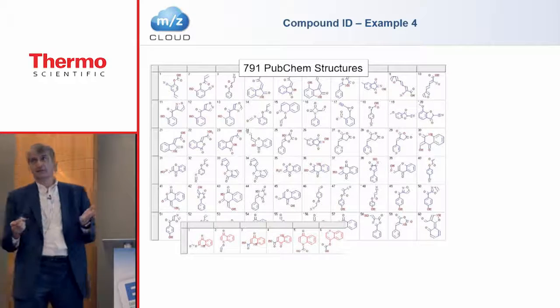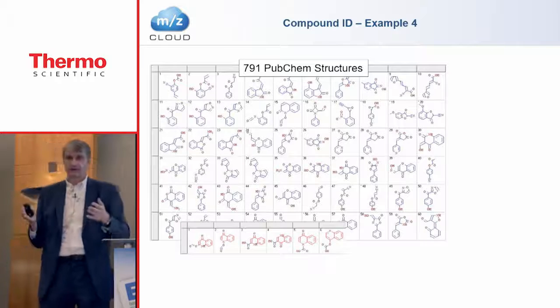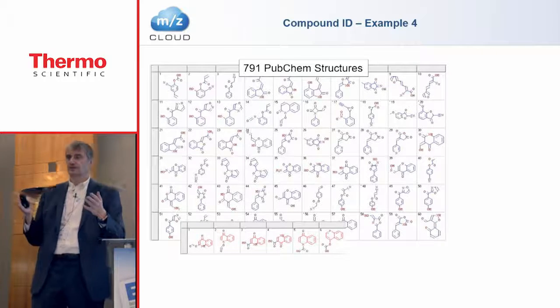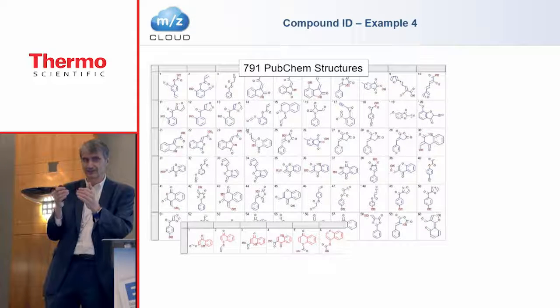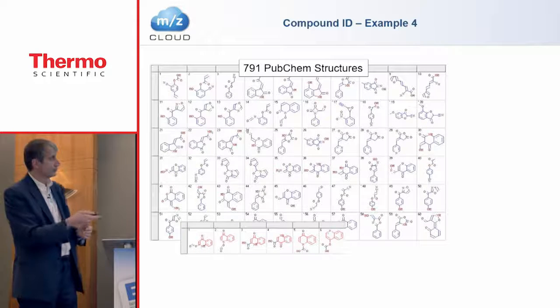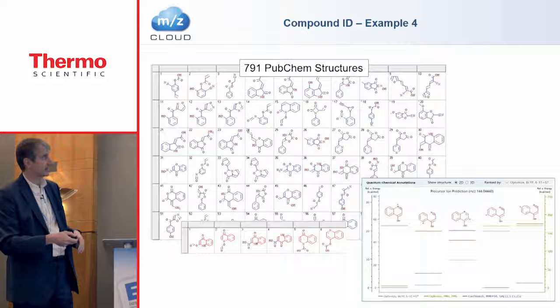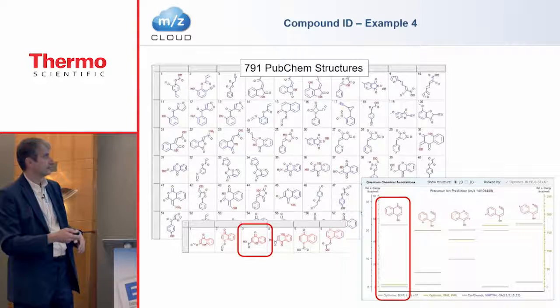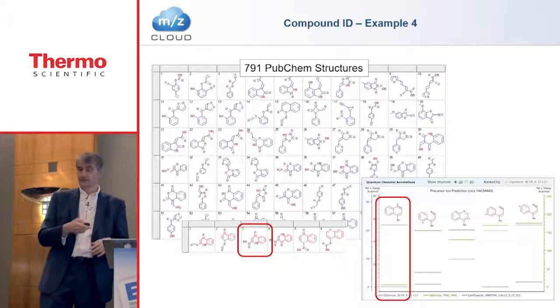Well, the typical experiment in mass spectrometry is you have an MZ value, you search in a structural database, and you would like to restrict all these candidates to one or a limited number of them. Using precursor ion fingerprinting, we identified those compounds, and if we have high quality fragments like this one, calculated quantum chemically, we can with certain probability say this is this one.